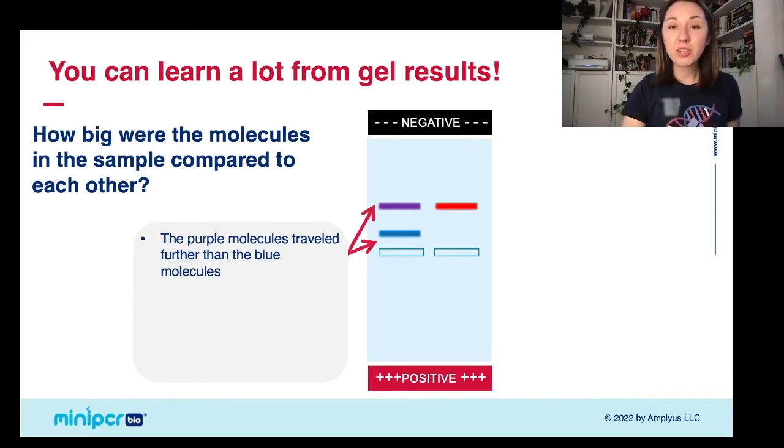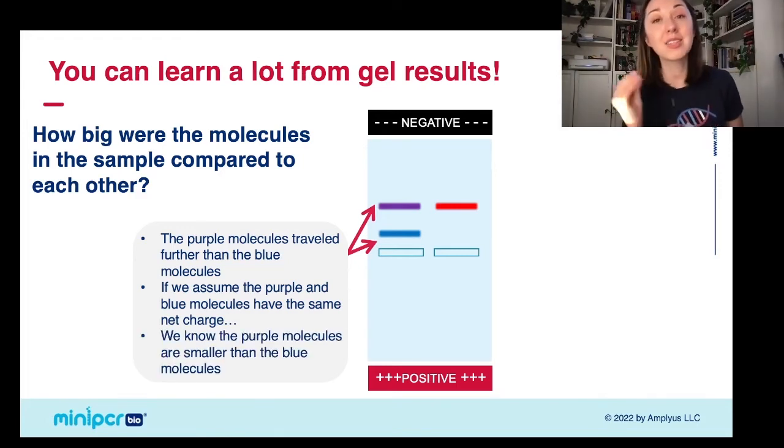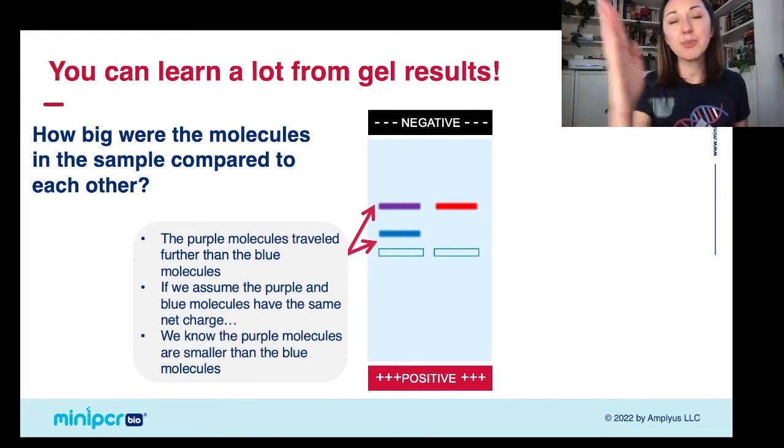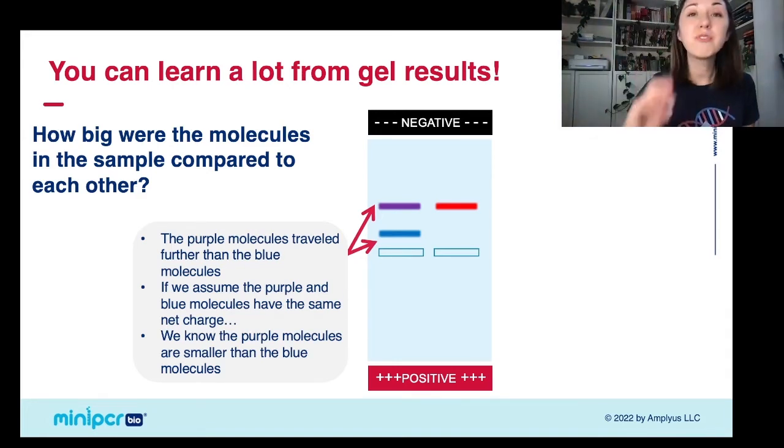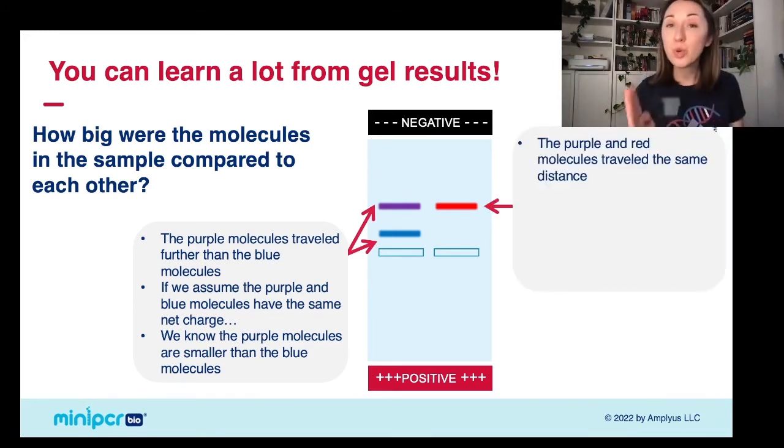So the purple molecules traveled further through the gel than the blue molecules. If we assume that the purple and the blue molecules have the same net charge, which we're doing for all of our dyes, we can tell that the purple molecules are smaller than the blue molecules because they were able to zip through all of those little holes and pores in the gel faster and move farther towards that negative electrode.